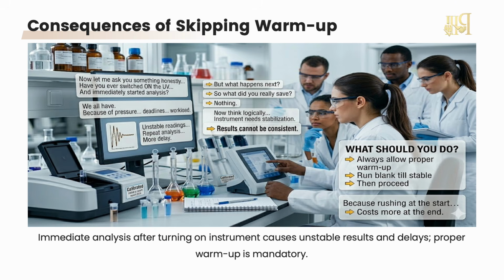So what should you do? Always allow proper warm-up. Run blank till stable. Then proceed, because rushing at the start costs more at the end.